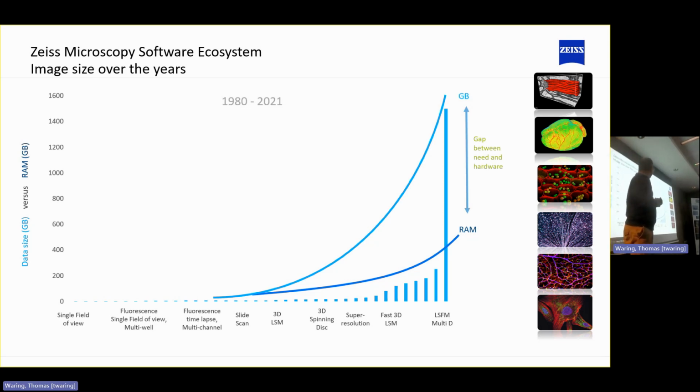I think I have 20 terabytes on my desk at the moment, and I'm forever getting data sets and hard drives sent to me through post or emailed to me. And what's happened over the years is our images have gone from being a few hundred megabytes with things like the lattice light sheet, or if we're screening, as some of my customers do, 24 well-plate organoid screening with Airyscan, we're generating single files that are close to a terabyte in size.